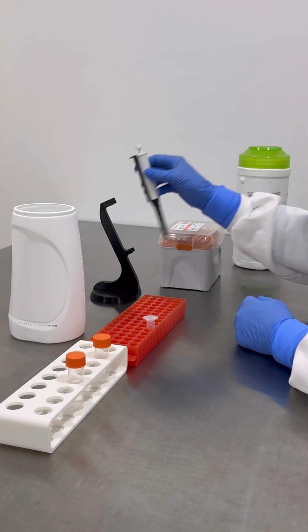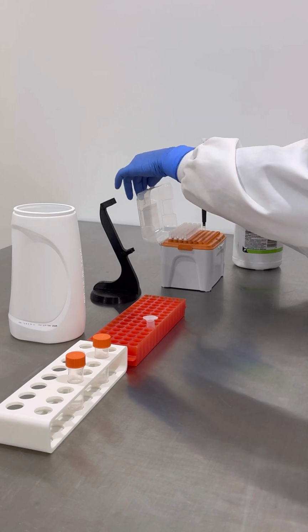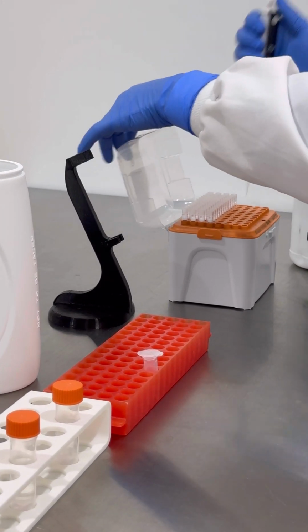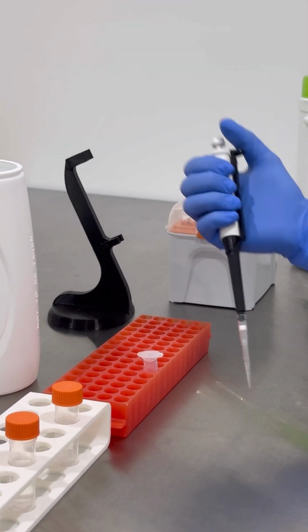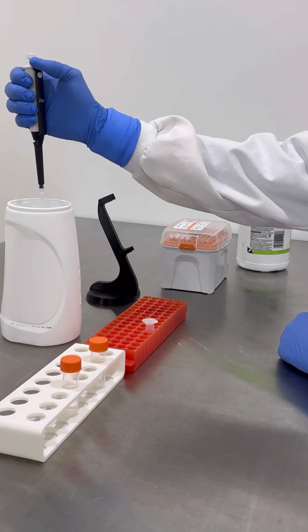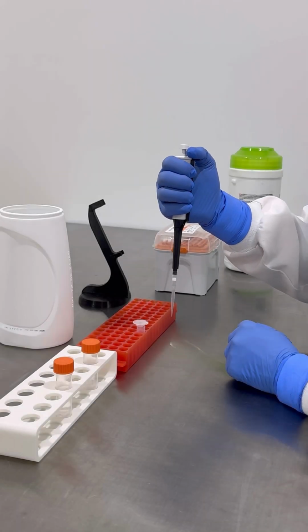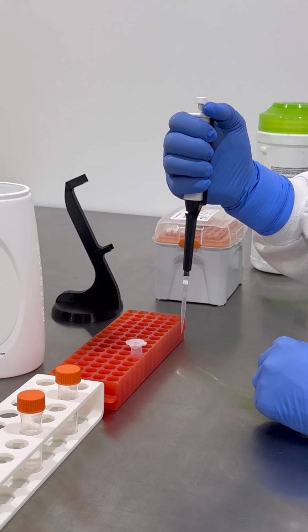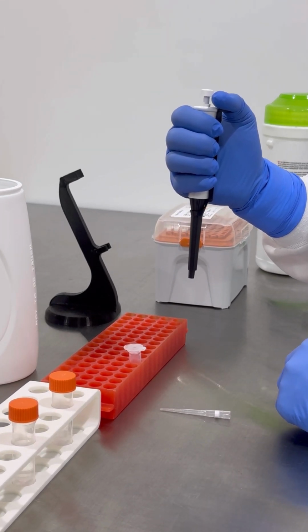Always use a new tip between samples and for each reagent. Be aware where the tip touches. If you bump a rack or the bench or the outside of a tube, then you must discard that tip. If a used tip falls onto the bench, leave it there until the end of the testing.